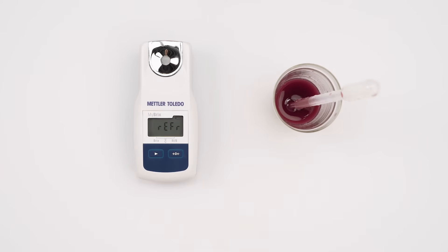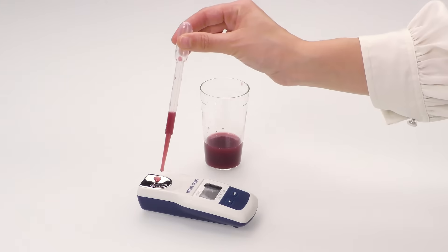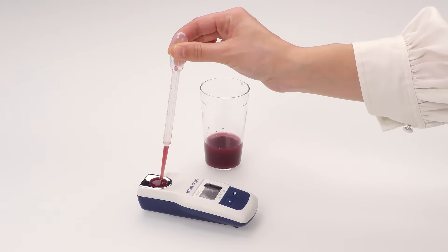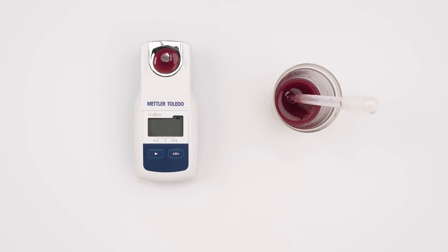Press the read key to turn on the instrument. Add your sample, approximately 0.3 milliliters — the prism must be nicely covered. Press the read key to measure.